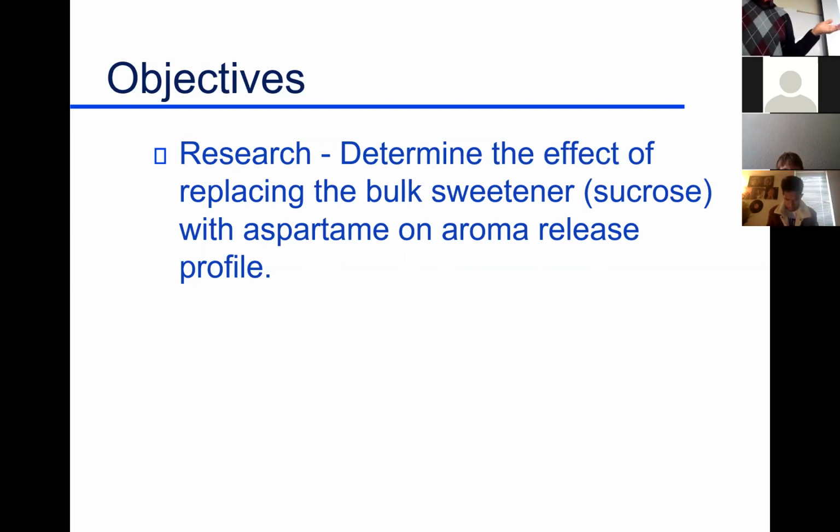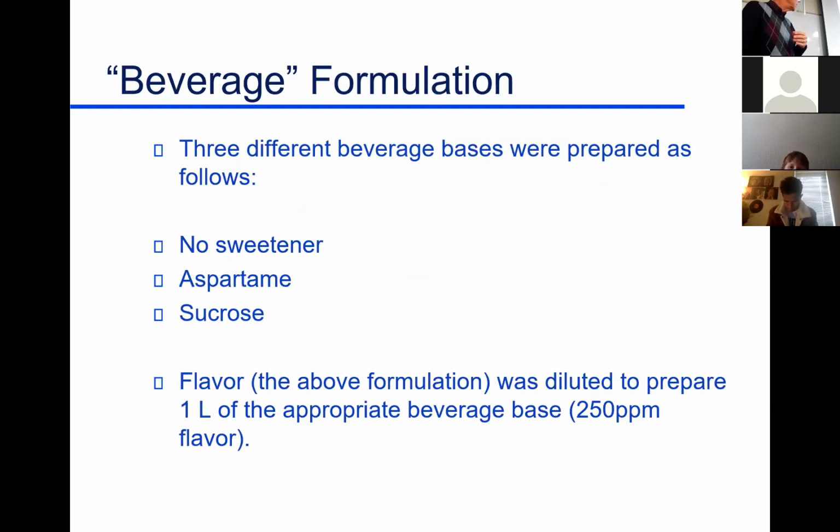Why are they different? The company originally starts off putting exactly the same flavor into water that has sugar, and they put it into water that has aspartame, for example. Why are they different? Why should they be different? And so, again, mass spectrometry is a tool that's been used to look at this type of issue. In this particular experiment, we added flavor to a non-sweetened beverage base, an aspartame sweetened beverage base, and a sucrose one. So we got three different samples. And we were interested in what's given up during the drinking process to go back to your olfactory region and get a flavor sensation from it.